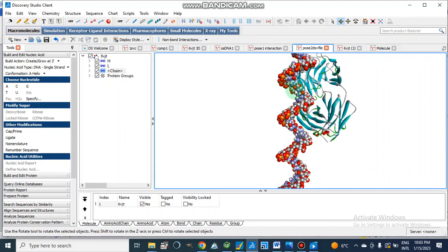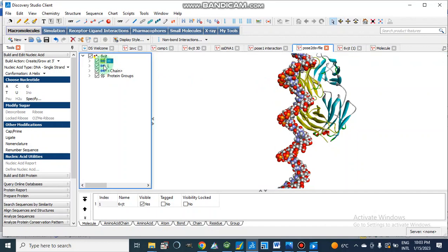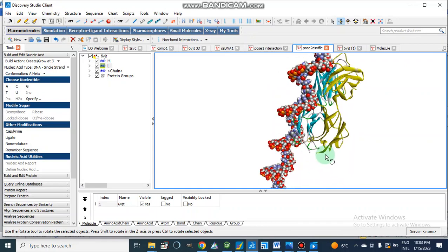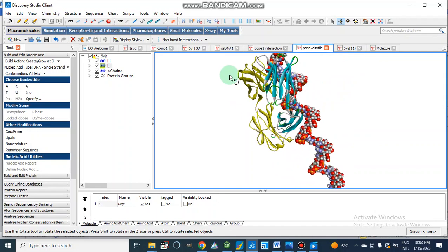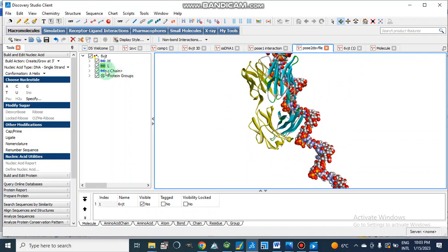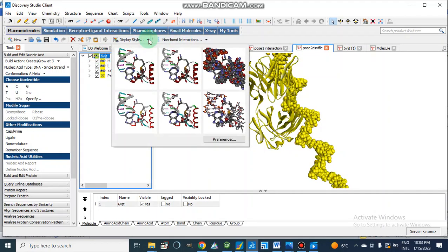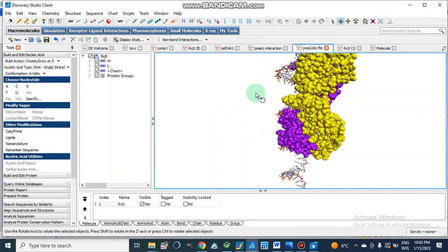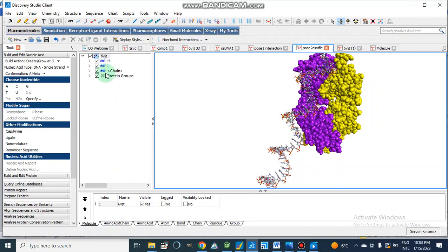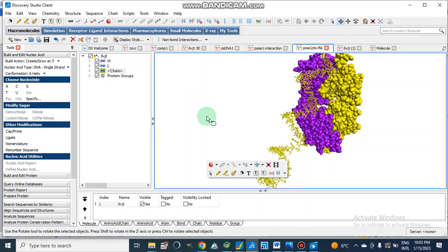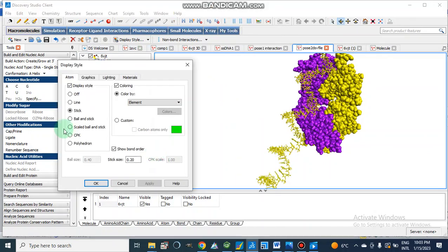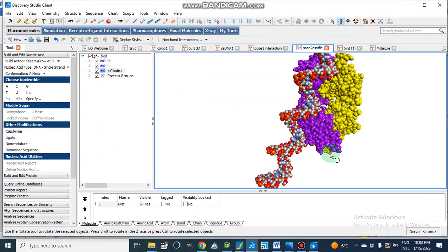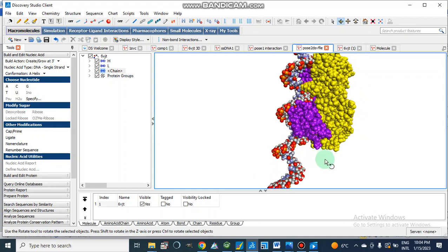This protein is going to bind here at this pose. We can change the format of the protein display. This is the H chain and this is the L chain which is going to bind here. We can rotate and check how it is going to bind. We can also modify this chain in different display styles. Now this is our protein — two chains — and this is our DNA that is going to bind as the ligand. I am going to change its style to CPK style. Now this is our DNA which is going to bind with the protein antibody.